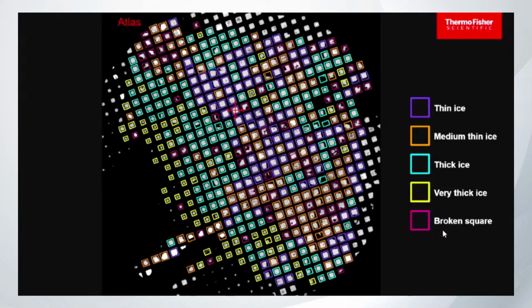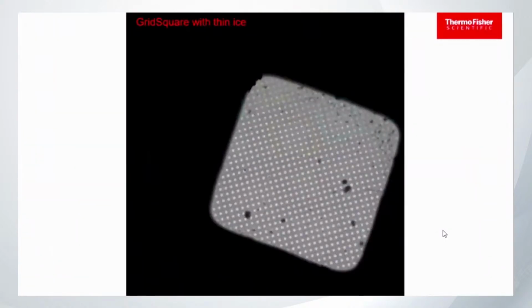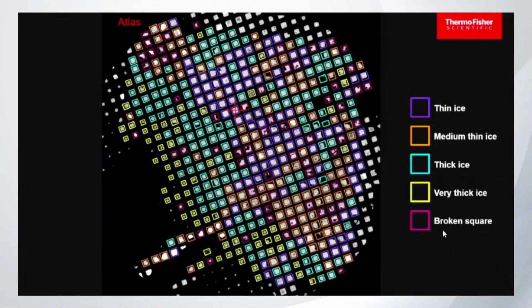When you transfer the grid into a transmission electron microscope, every single tweezer, every single thing touching that grid is going to be under liquid nitrogen conditions, okay, to avoid any ice contamination. So you have the grid in your microscope, and the microscope is cooled down as well, okay?